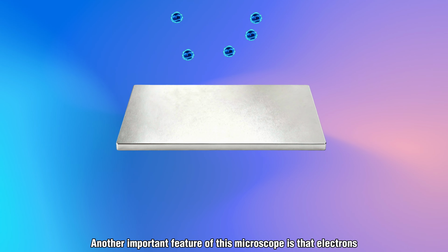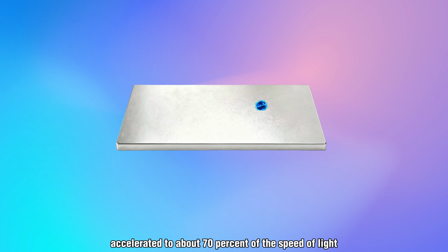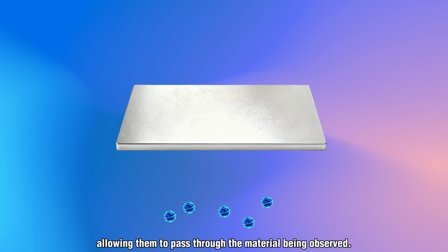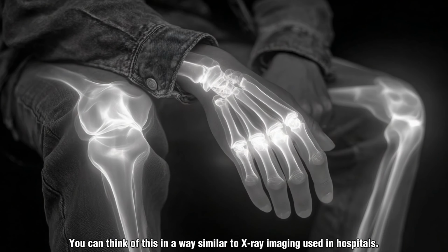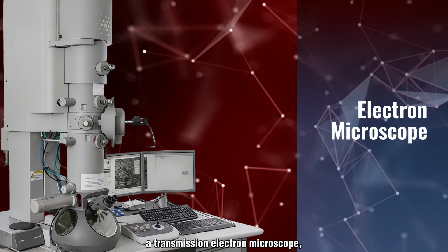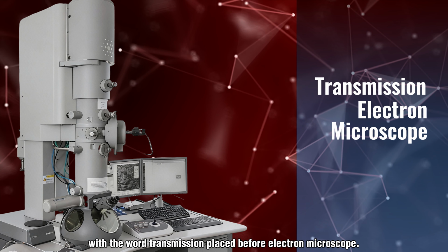Another important feature of this microscope is that electrons accelerated to about 70% of the speed of light carry very high energy, allowing them to pass through the material being observed. As they do, the electrons emerge carrying information from inside the material as well. You can think of this in a way similar to X-ray imaging used in hospitals. That's why this instrument is called a transmission electron microscope, with the word transmission placed before electron microscope.